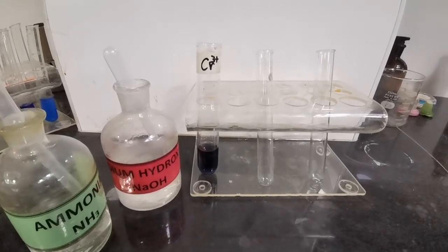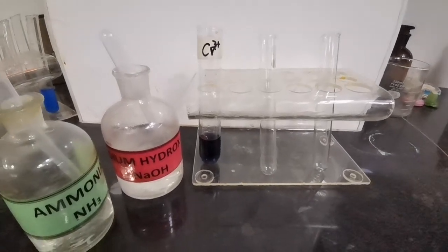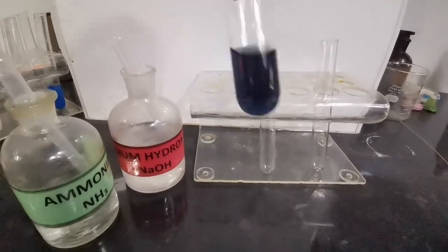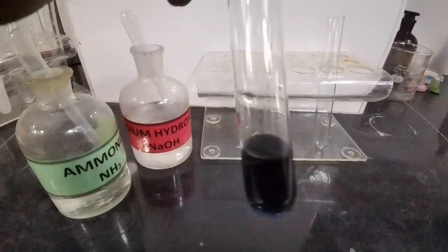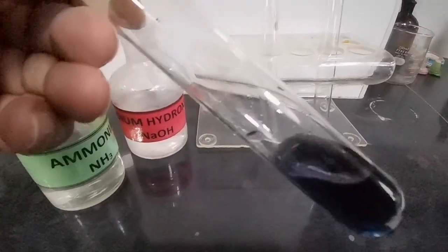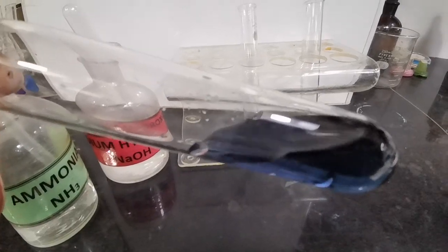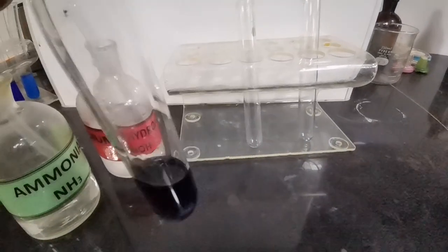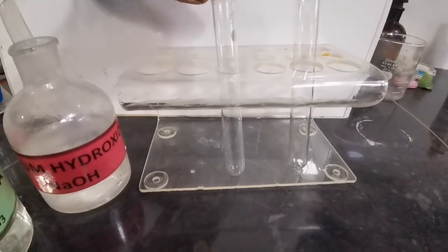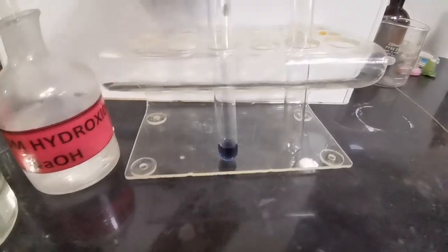We are going to be testing for Cr³⁺ positive ions in aqueous solution using NaOH and ammonia reagents. If you look at the color of this solution, it is a very beautiful blue-green color for Cr³⁺ positive ions. Now we take some of this into our test tubes to perform the ion detection tests.